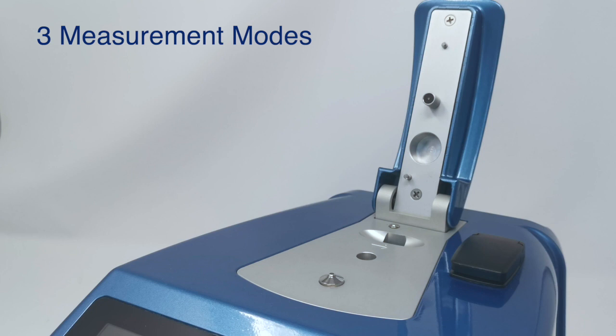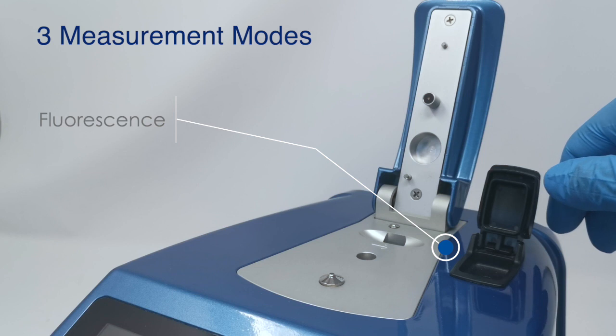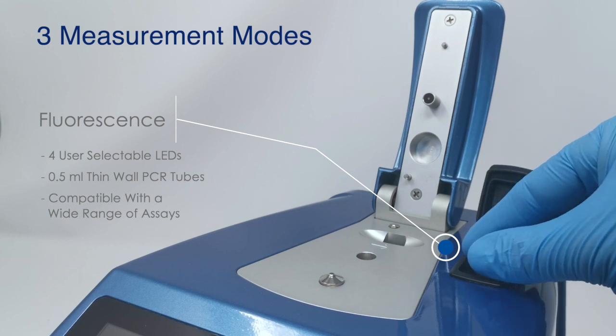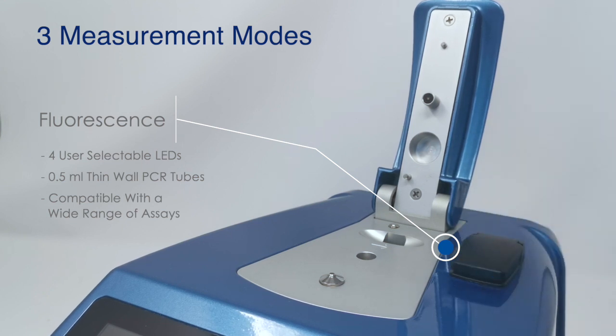Something that's unique to the DS11 series is we also have an integrated fluorometer. This fluorometer is a four-channel fluorescence instrument that measures fluorescence in 0.5 mm thin wall PCR tubes, and we'll talk a little bit more about fluorescence and the importance of it as we go through this presentation.